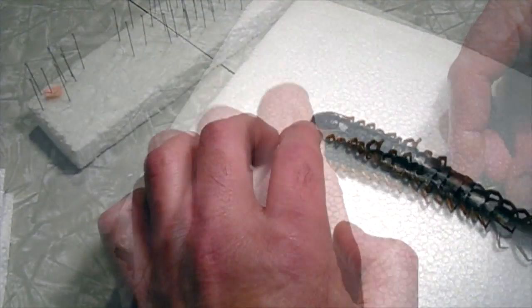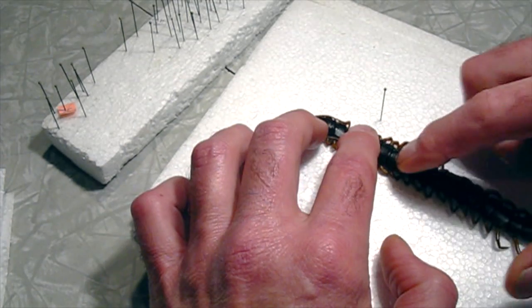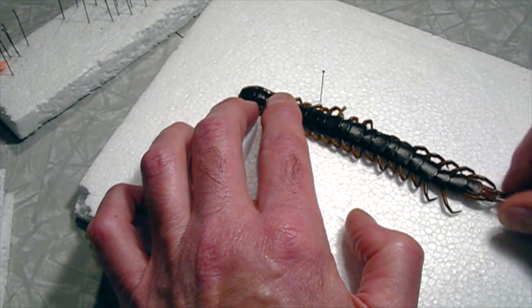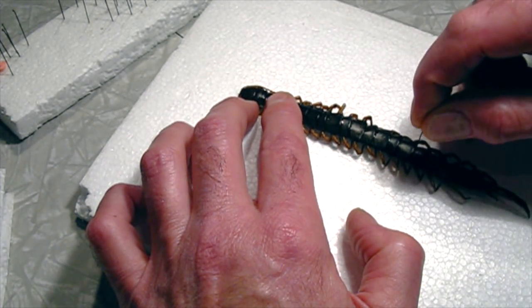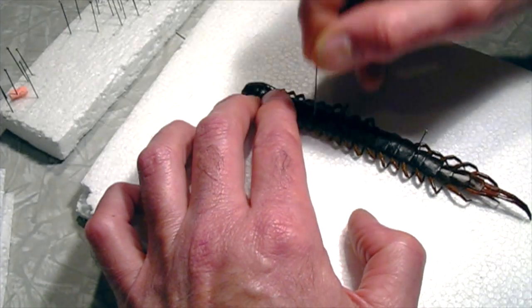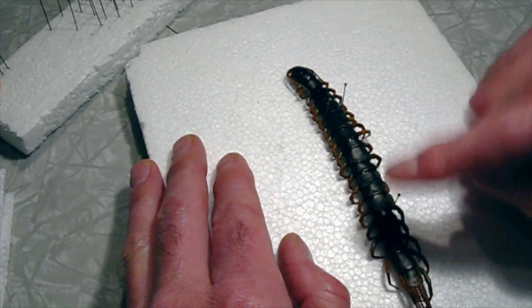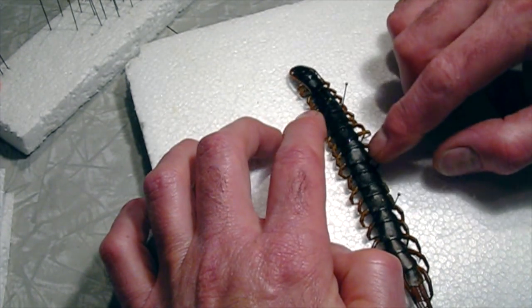Okay, now there's a couple different ways you can do this. You could actually put a pin through it. It's so long that one pin, while it will hold it in place, is not really adequate to support the whole thing. Sometimes I don't actually put a pin through them, I just put bracing pins on either side like this to hold it straight. And then as a specimen you can just set it down and use pins like this to hold the specimen in the position you want it in. And I think I'm going to go for that this time.